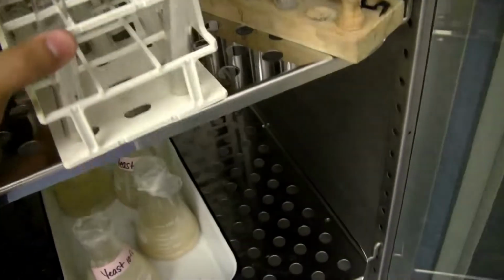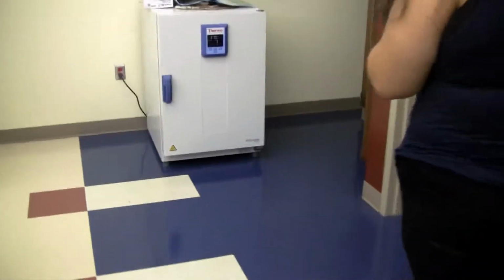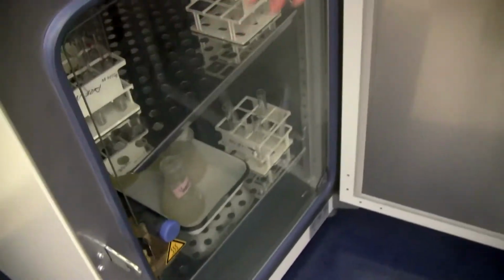20 minutes. You know what? I'll put mine down here. Okay, so this is one of the 5-minute checkups on our tubes. Let me see. Yeah, it's looking pretty good. There's our bubble. Yeah, it smells like fun. Okay, we still have at least 5 more minutes.